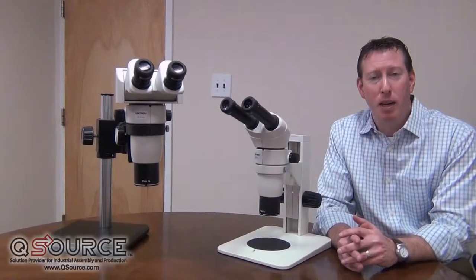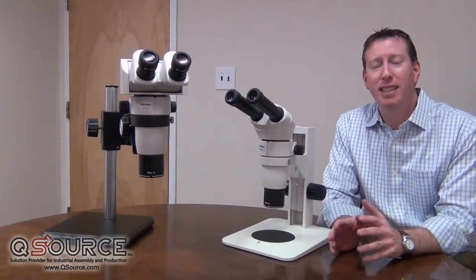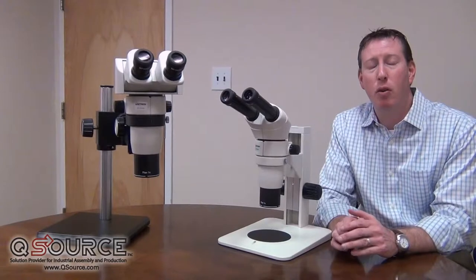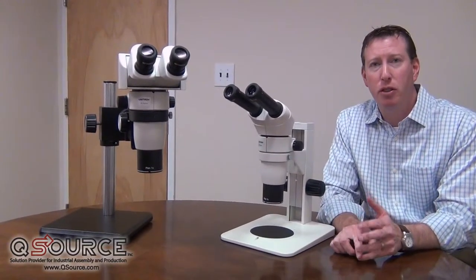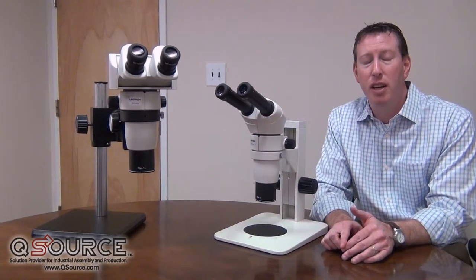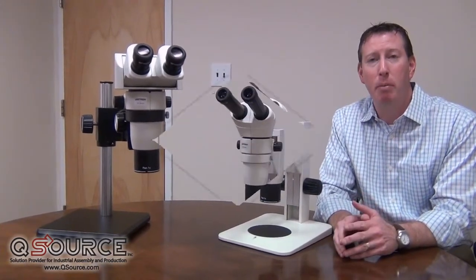Hi, my name is Brian Taub and I'm with Unitron. Today I'm here to talk to you about our Z10 series. Our Z10 series is our top-of-the-line stereo microscope series designed for medical device manufacturers, forensic applications, colleges, universities, defect analysis, and any other inspection type of application.